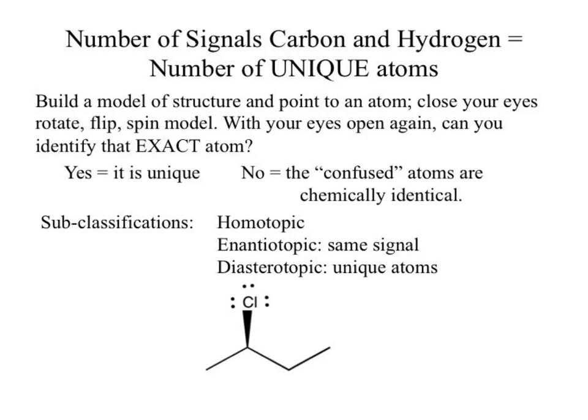But what happens if we go to an enantiotopic? Let's see if I can do this right. No, in fact, I think I had those backwards. Our hydrogens out here will be referred to as our homotopic. Our enantiotopic: these hydrogens are said to be enantiotopic.